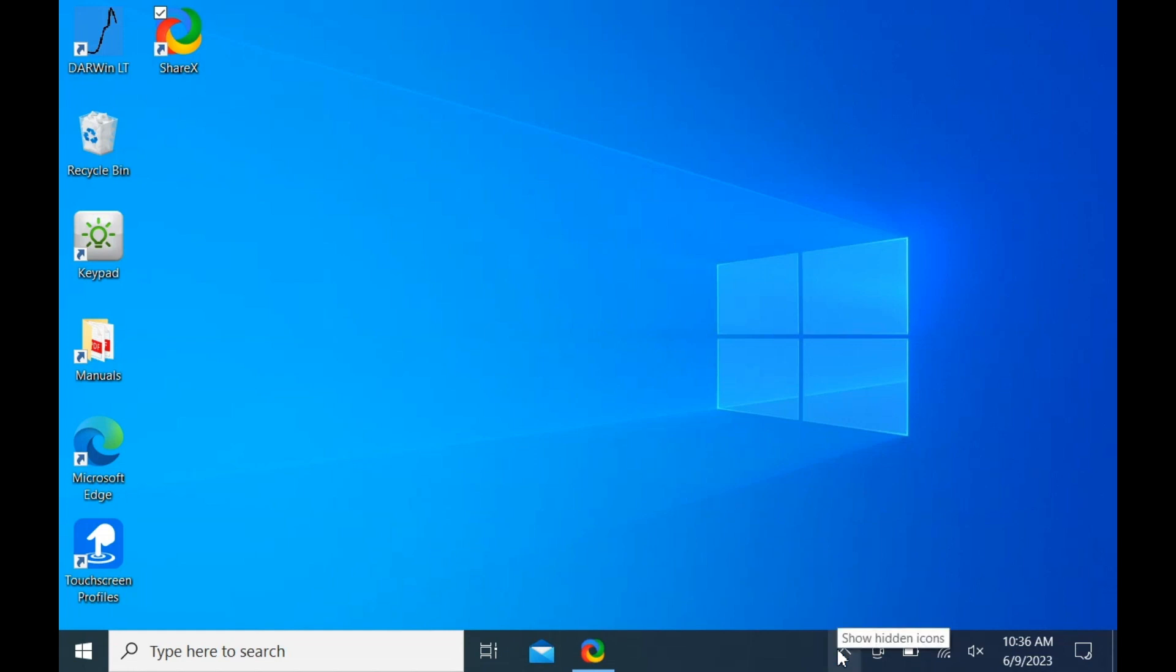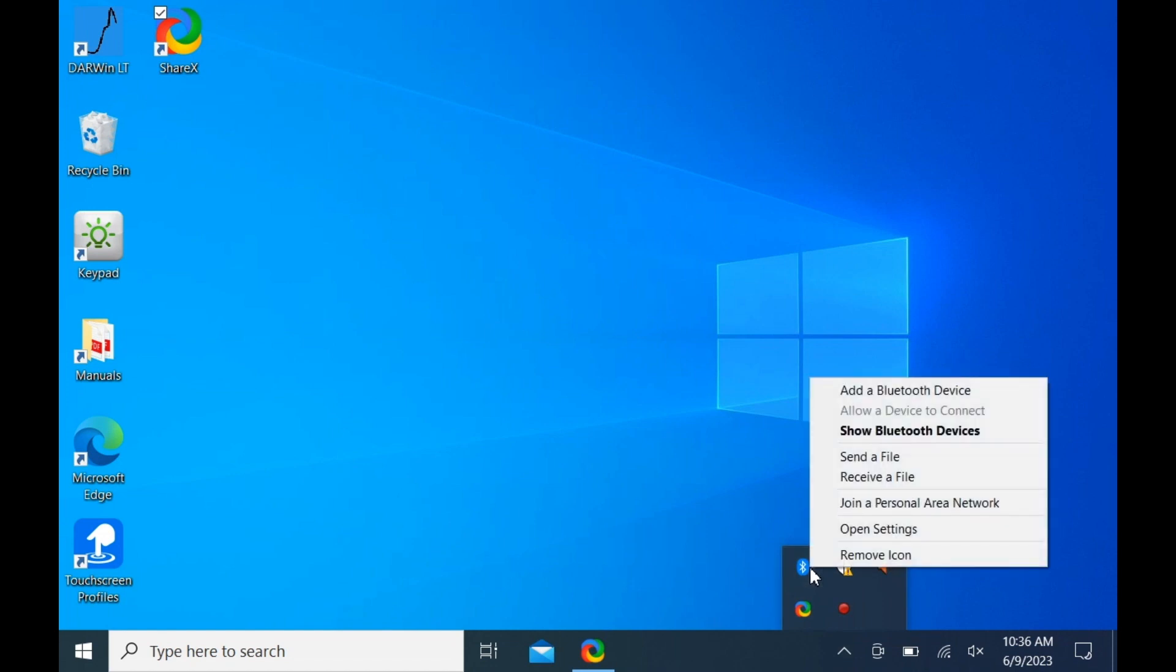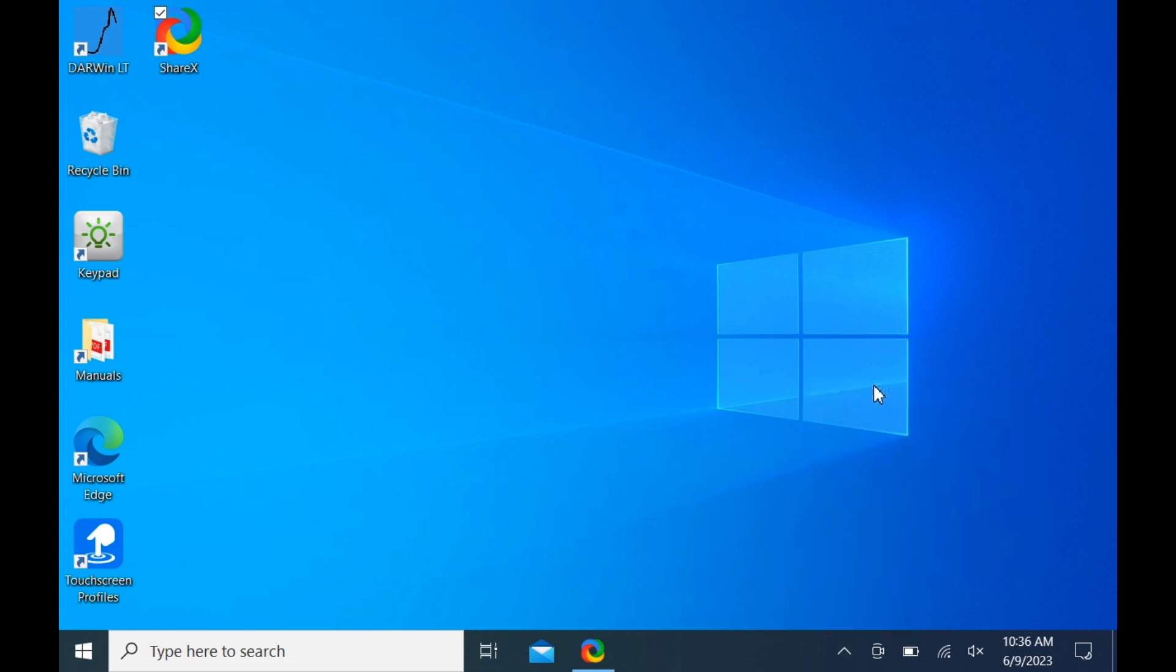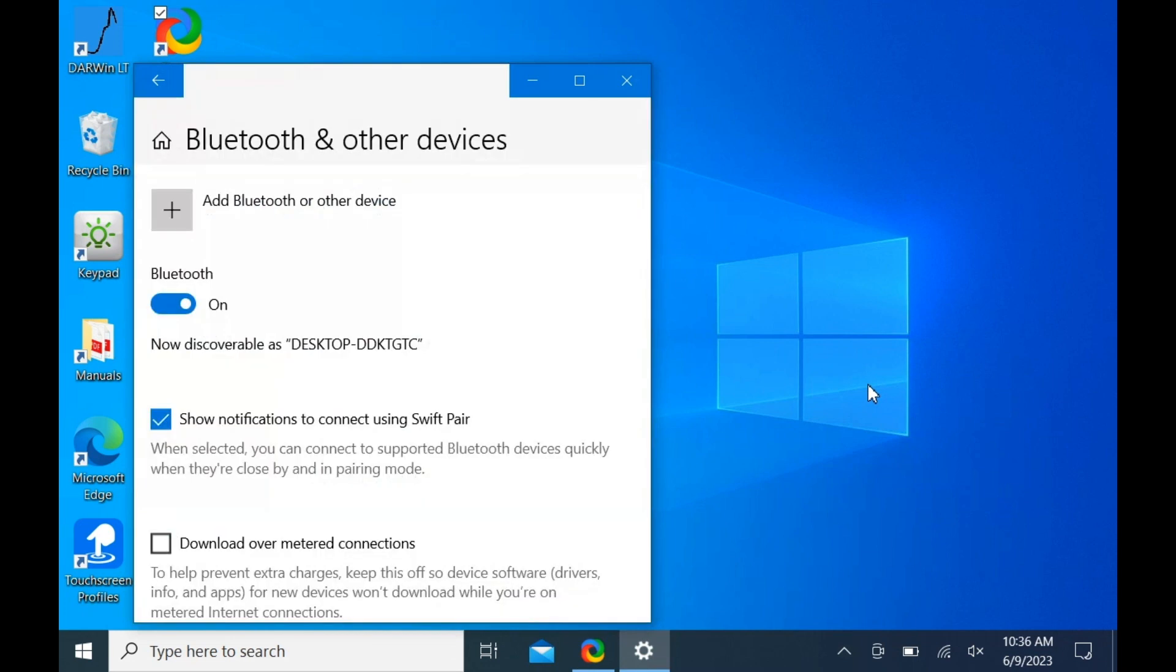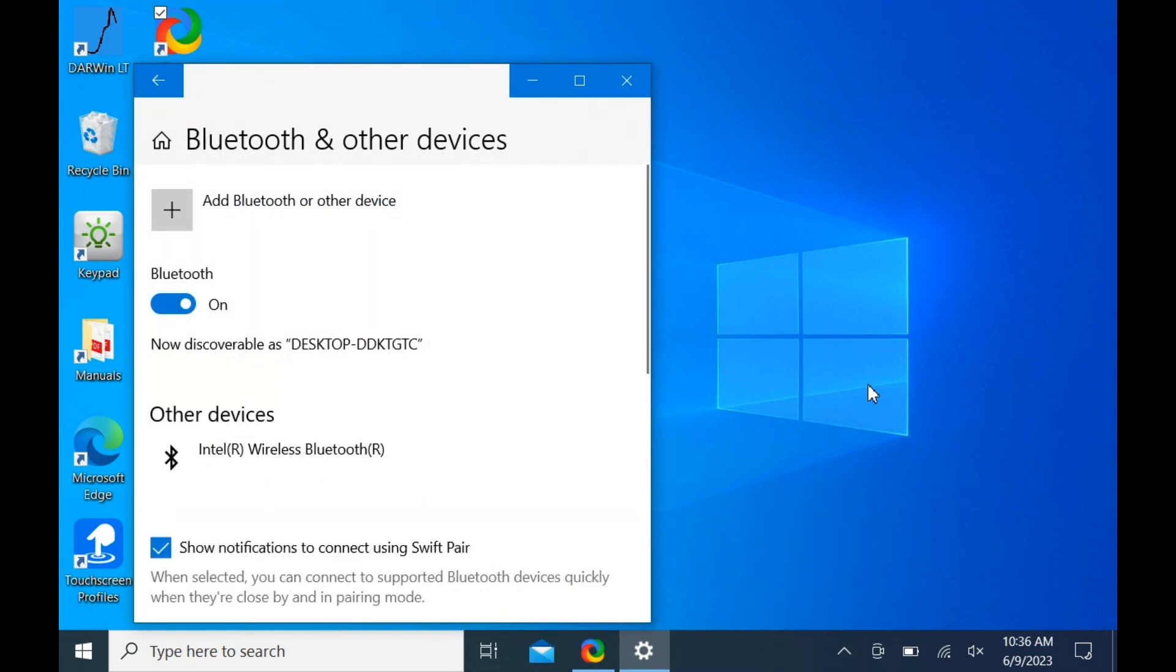Click on show hidden icons to reveal system options. Click on the Bluetooth devices icon and select add a Bluetooth device. Click add Bluetooth or other device.